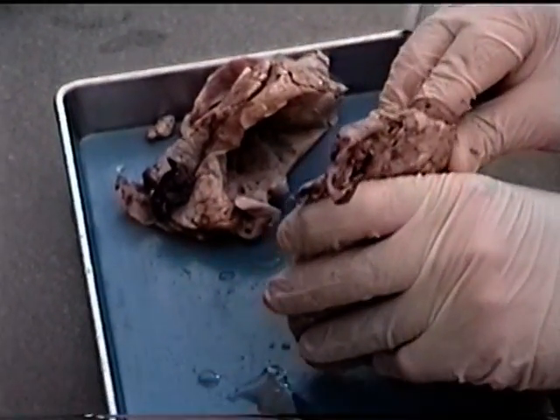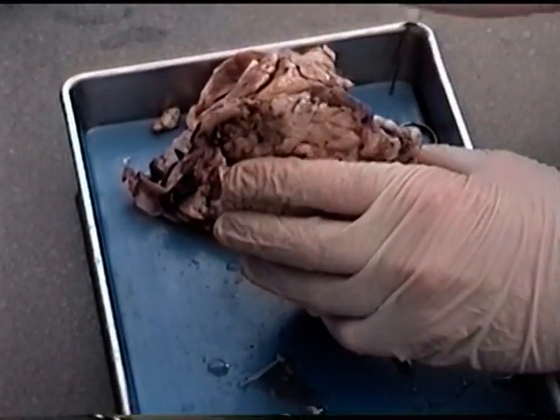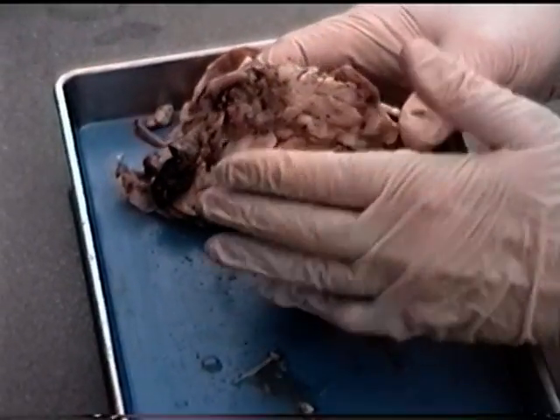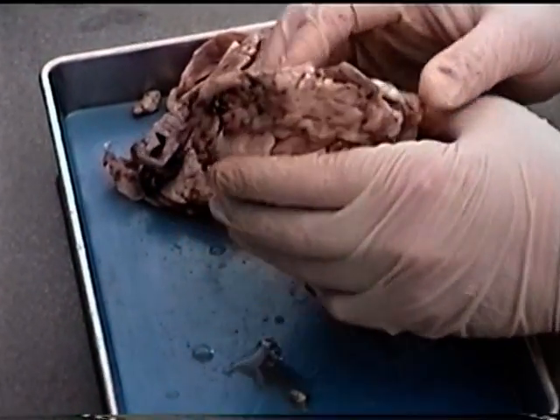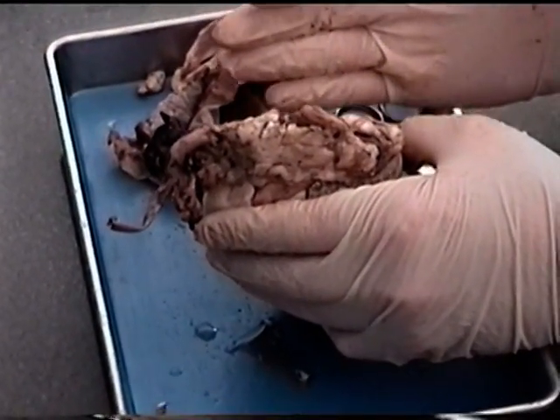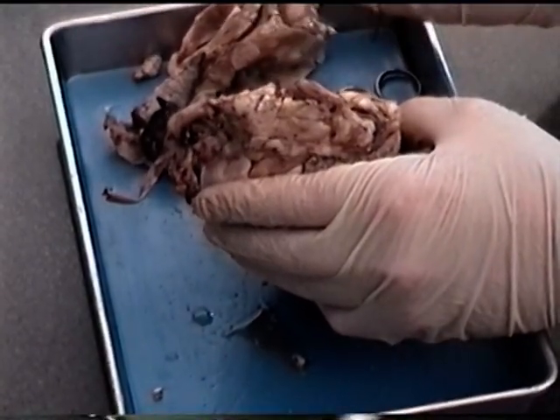So what you need to do then is to cut the heart, and we want to cut the heart down in this manner so that when we're cutting through the heart, we're going to separate the anterior view of the heart from the posterior view of the heart. So essentially what we want to do is a coronal or frontal plane on the heart itself.